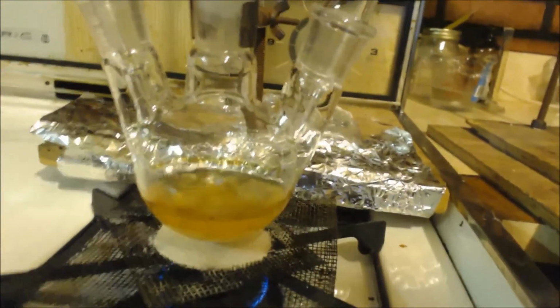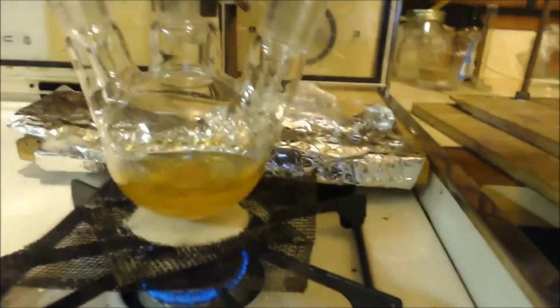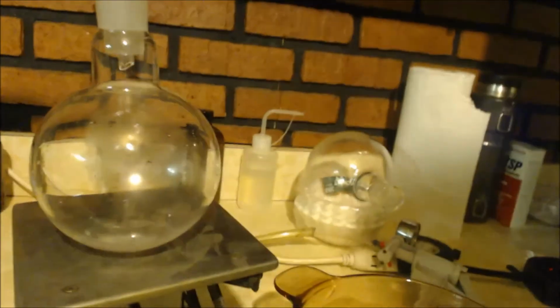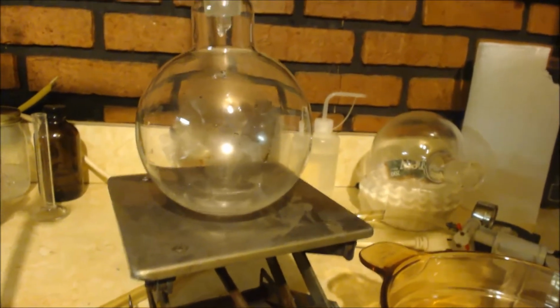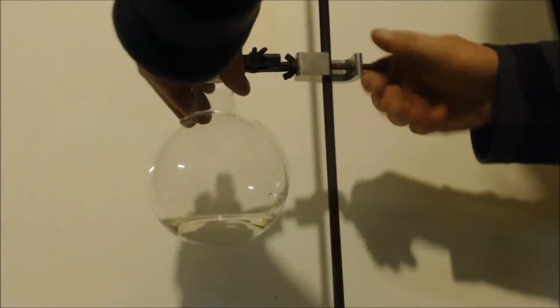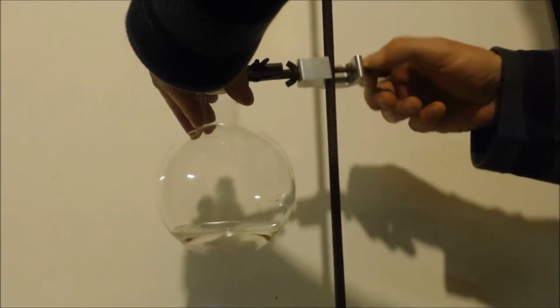Well, after an hour or so, I was like, screw it, it's not turning red. So I threw it in there. Got that bigger column. It's already started to come over. Right now it's coming over at the proper temperature. Oh, there you go. That's what I got. It's nice and crystal clear.